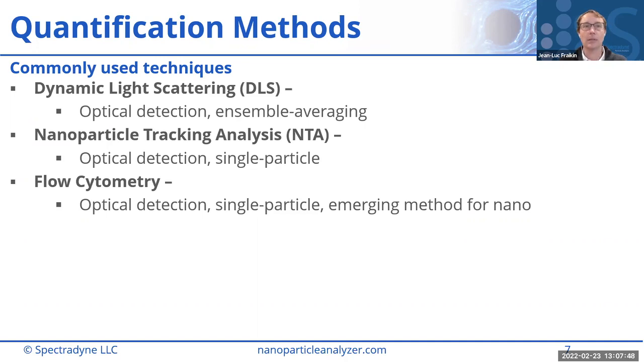There's another optical detection technique. It's single particle. We're counting particles one by one. And it's emerging as, I think, a pretty promising avenue for nanoparticle analysis going forward. You'll notice that these three top measurement techniques, though, are all optical methods, right? And so they're looking with a very similar, or sometimes the same, lens at what's in the sample. So let's look to what we call orthogonal techniques, and that's not our term, but it means a way of analyzing particles with a fundamentally different approach, right?